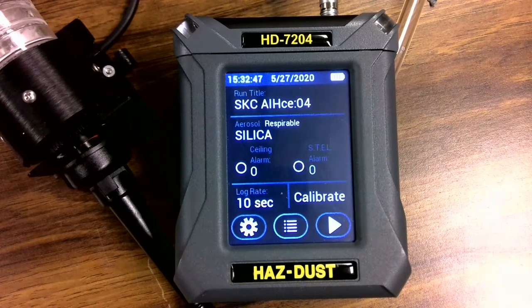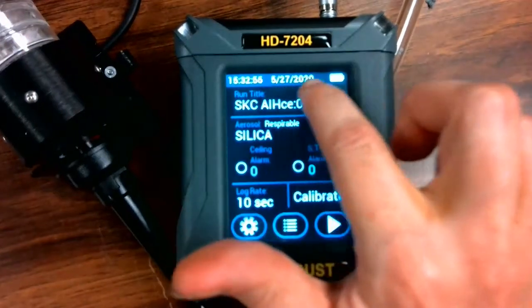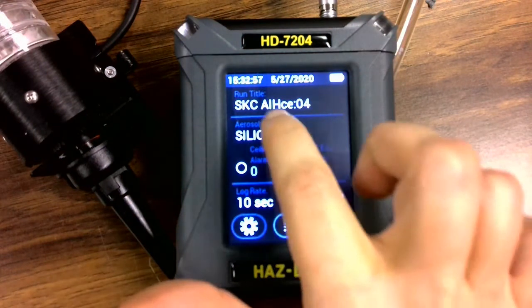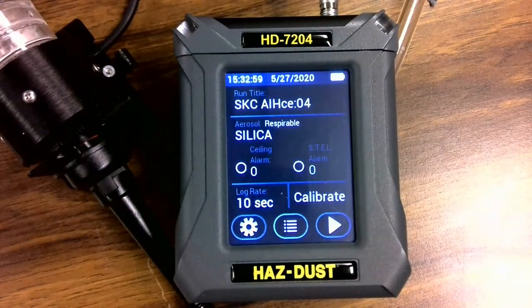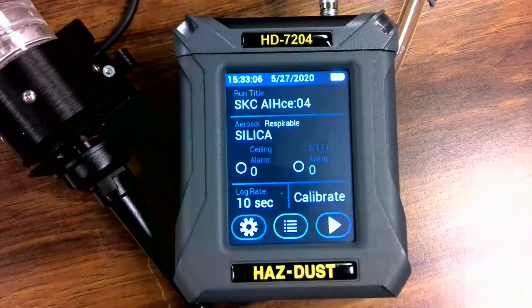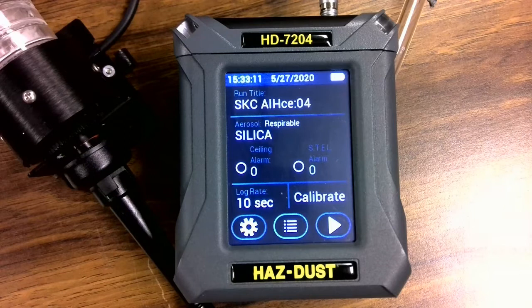The flash screen will disappear after a few seconds, and the home page will be displayed. At the top of this home screen, you will see the date, the time, and the battery status. Next is the run title or name of your data set. In this case, I've called it SKC AIHCE. The 04 after the run title indicates the number of data sets already stored in the instrument.